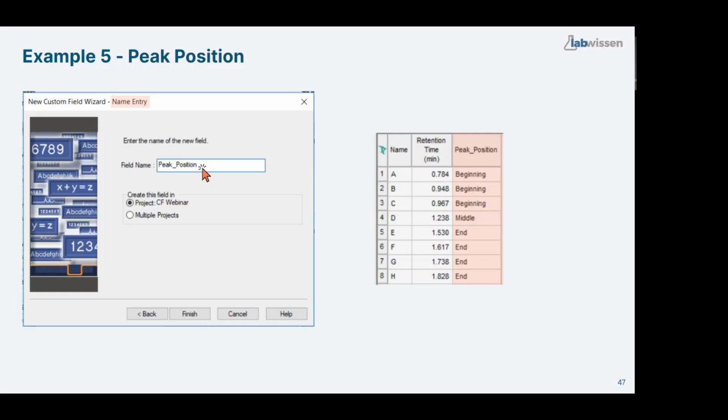Wow, such a great question. All right, I take it. I'll write you an email. Is it okay? So we don't go through it now. I need to check it by myself. It's regarding system pressure maximum. But when I read the first sentence of your question, I already thought about a knowledge base article. So I will check it later and I'll write an email.